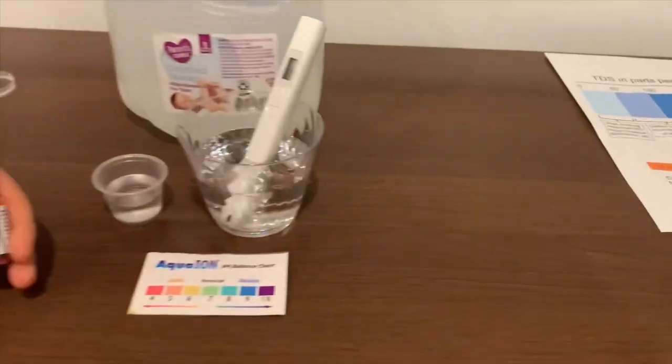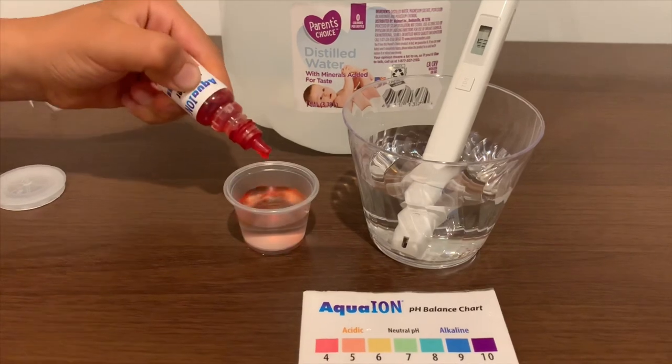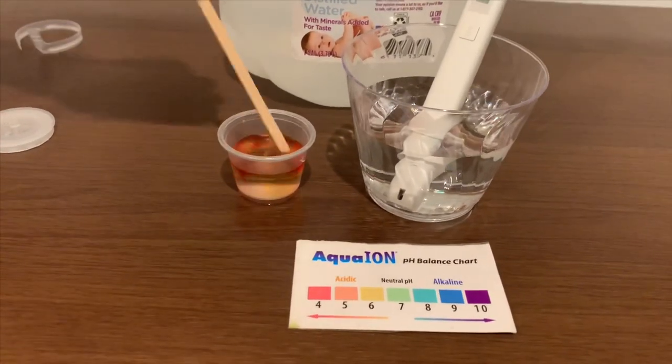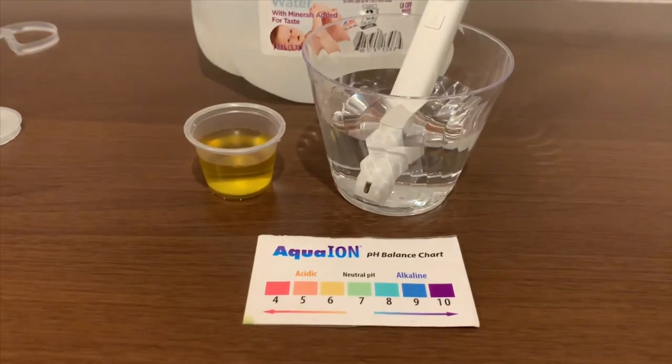Now let's test the pH. If you want to buy this pH tester, check the link down below. I'm going to do two drops and stir it a little for a better result. I'm going to give this a 6.5 — this is acidic.